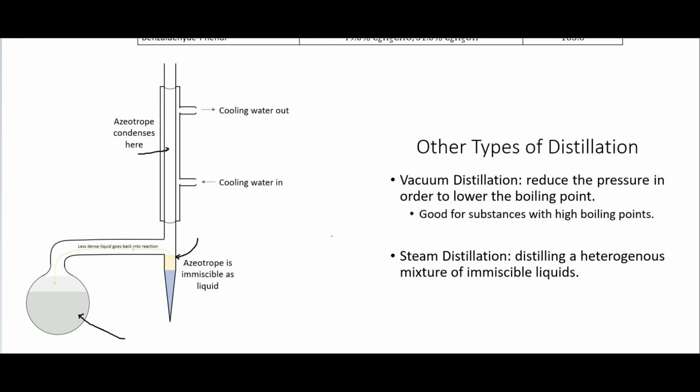And that's something you can do if you are trying to use Le Chatelier's principle to push a reaction towards products. And you have, say, a product coming out here and ending up down in this part of the vessel so that we're removing that product and then pushing this, say, maybe a reactant back into it so that we can exploit Le Chatelier's principle to push a maybe inefficient reaction towards products. And so that is something that we can actually use this azeotrope for.